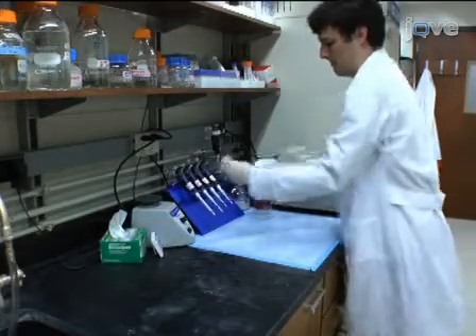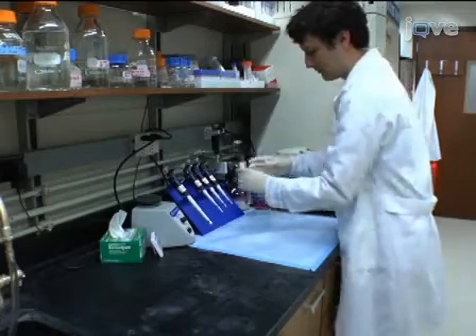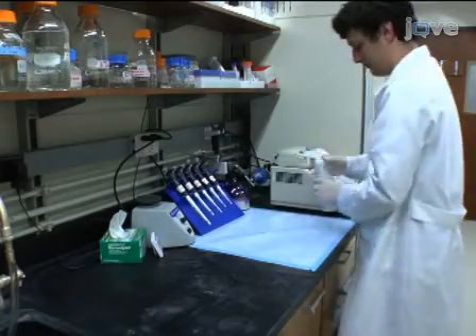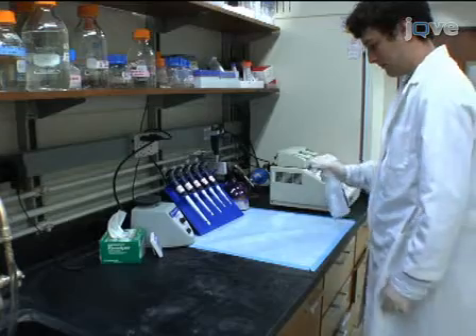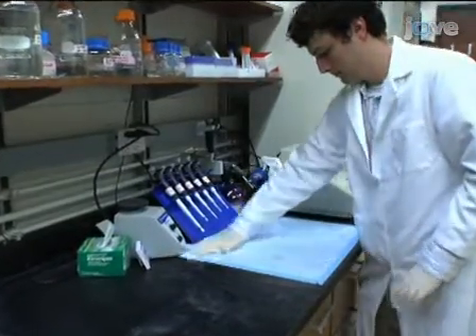When working with RNA, it is very important to work in an environment that is free of RNases. Use simple precautions such as having reserved pipettes for use only with RNA procedures and spraying the work area with RNase Away before starting extraction of total RNA.